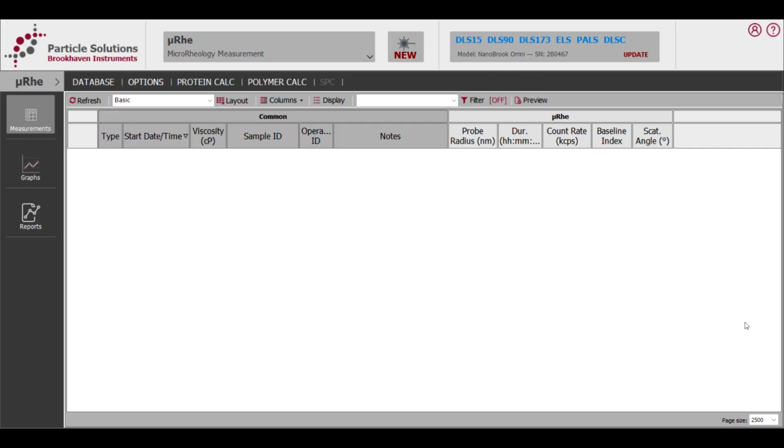Hello and welcome. In this video, we will very briefly demonstrate making a microrheology measurement using the NanoBrook series of dynamic light scattering instruments from Brookhaven Instruments.